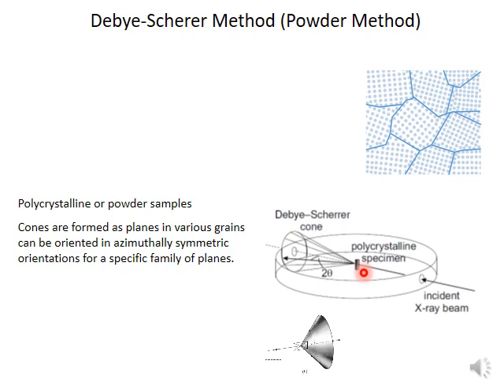So for a specific HKL, which is the reciprocal lattice vector, a full cone of scattering is emitted or scattered around a certain azimuthal axis. This is entirely due to the fact that you have all these different geometries possible. So you can look into detail why such a cone is formed, but just to let you know that a specific HKL or a specific reciprocal lattice vector in this scattering corresponds to one cone of scattered light.